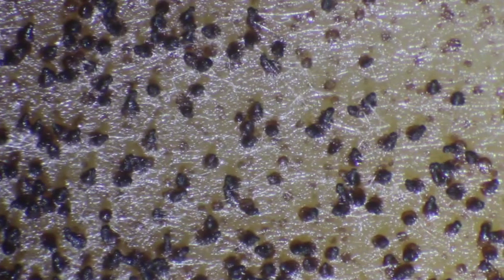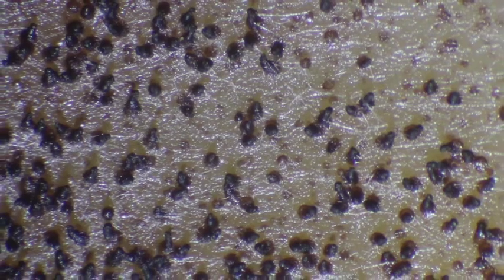So here's a view through our dissecting scope of these little teeny tiny mushrooms, or the equivalent of mushrooms, in the Sordaria. I'm going to go ahead and zoom in. With dissecting scopes, you can do things like that. So I'm going to zoom in, then I'm going to focus. We can see these individual mushrooms. Inside these mushrooms are spores.